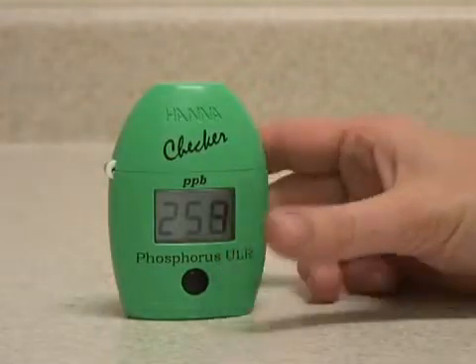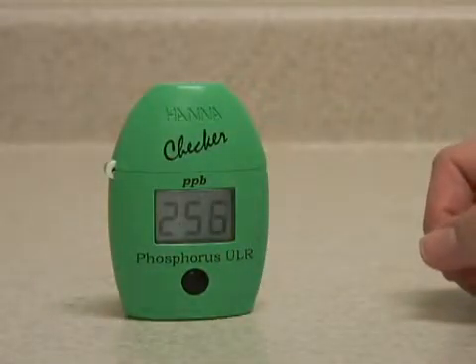The meter will count down three minutes, then analyze the sample and display the reading.